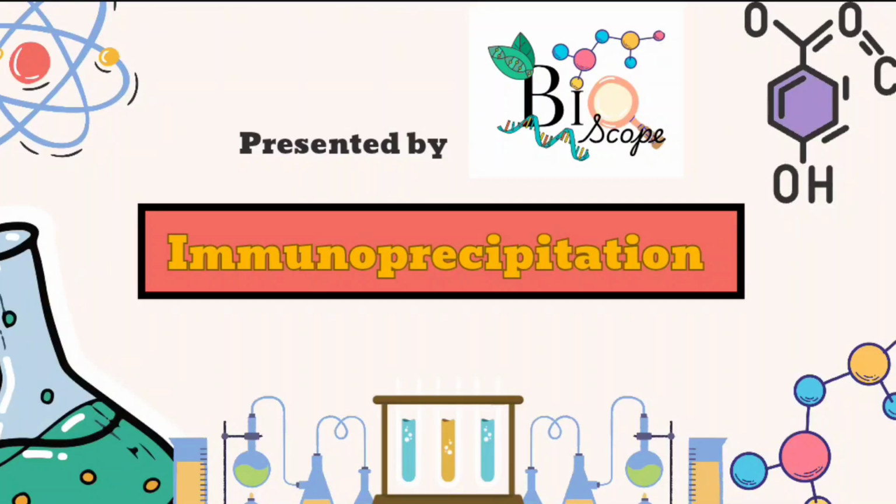Imagine you are trying to find one specific friend in a stadium filled with thousands of people, but you have a magical magnet that attracts only them. That's exactly what scientists do when they want to find one specific protein among thousands in a cell.